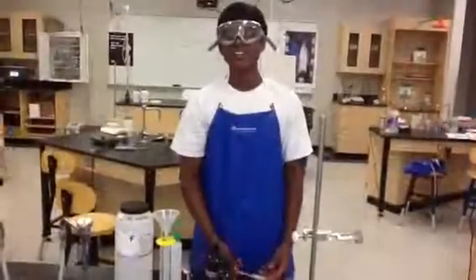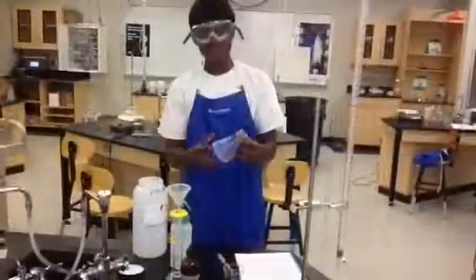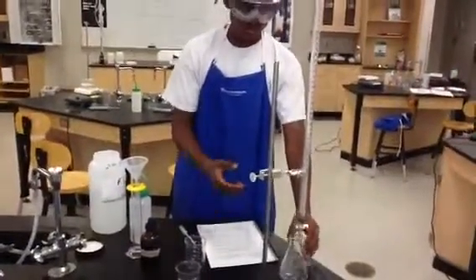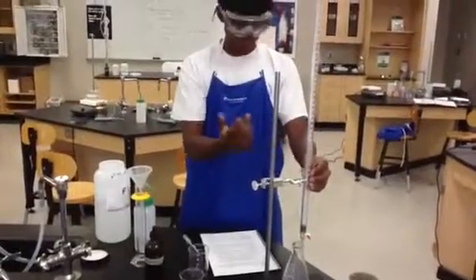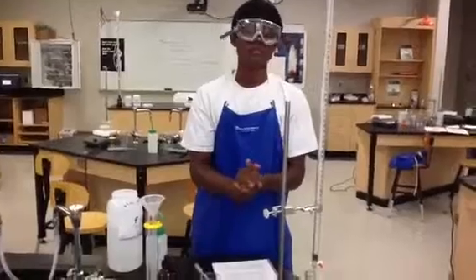Now, the most important thing to remember in this entire experiment is: do as you're told, add acid to water. Always remember to wear your goggles and apron when you're performing this lab. You obtain an Erlenmeyer flask from your teacher, and you should rinse out all the beakers, the burette, and the flasks that you obtained with distilled water before you perform the experiment.